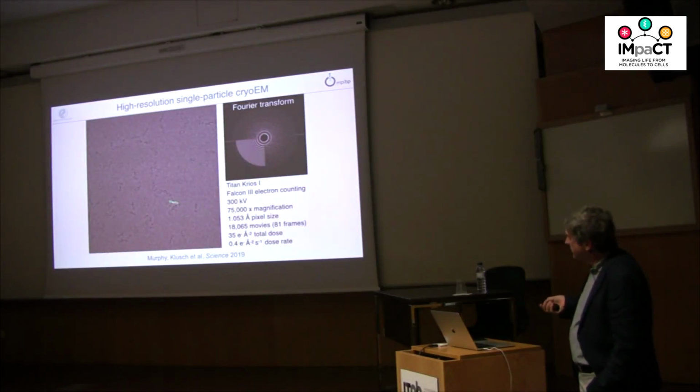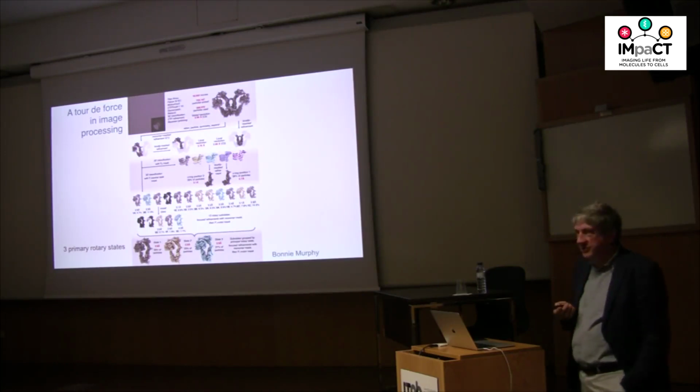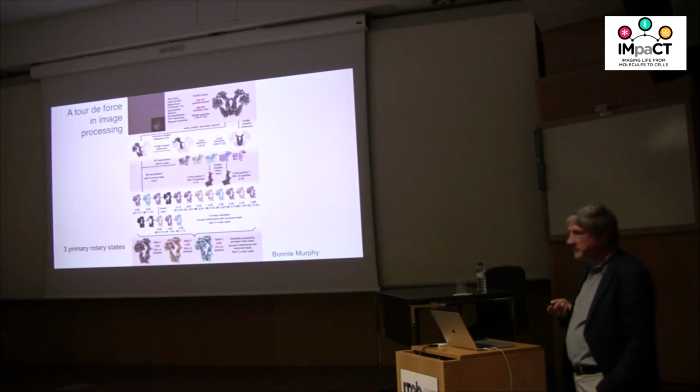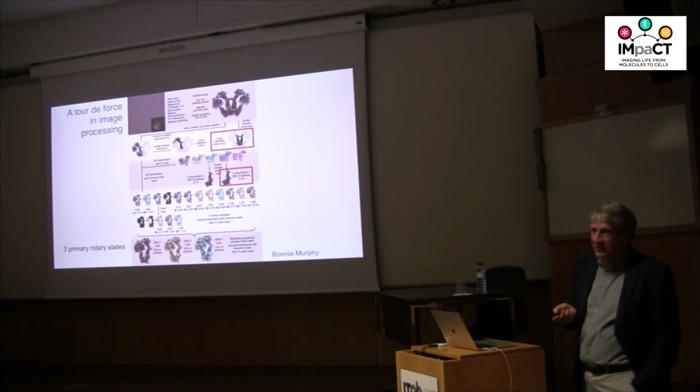They're not so easy to see, they're dimers, but they're good micrographs, and we can get a lot of them. In this case, it was 700,000. And Bonnie Murphy processed these, and she's a real ace processor now. She started 2.5 years ago from scratch, didn't know anything about cryo-EM, and she's now become a real ace image processor and also imager. So again, the resolution is not isotropic, but in the best part, it's 2.7 angstroms.